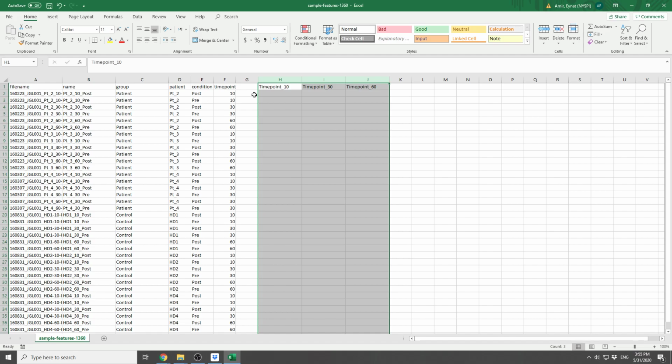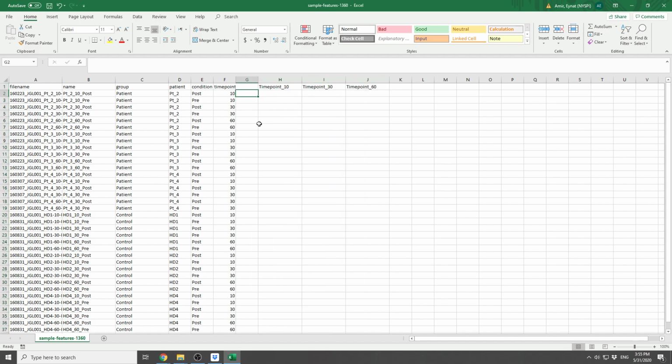And in each one of them, I would like to examine the cross between the patient group and the condition. So we're going to once again concatenate, sorry about that, and we're going to concatenate the group and the condition.